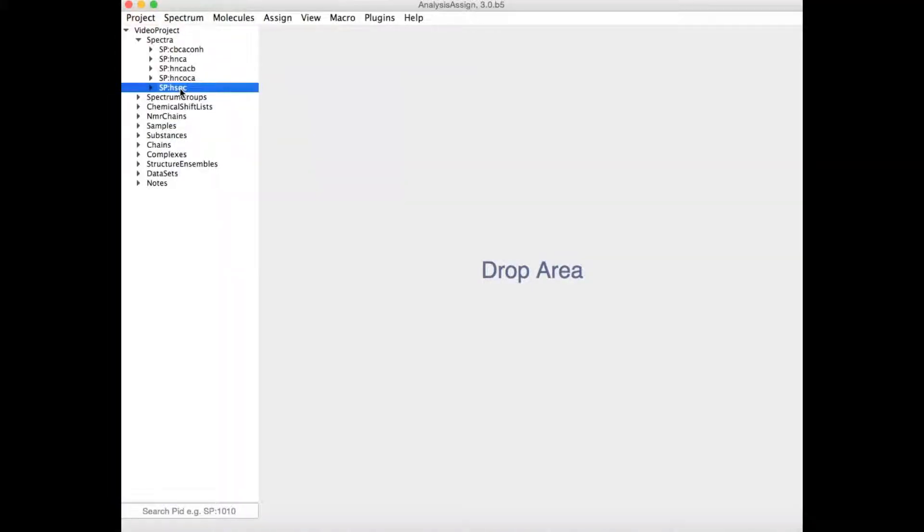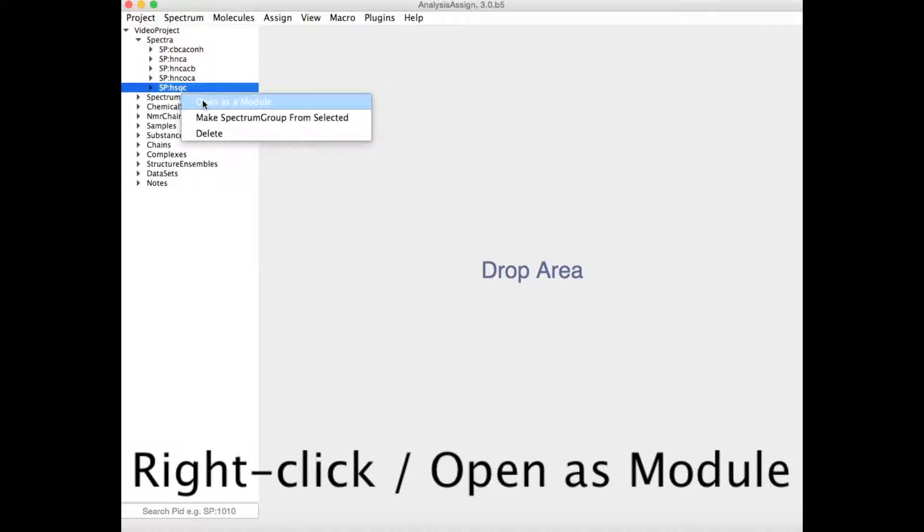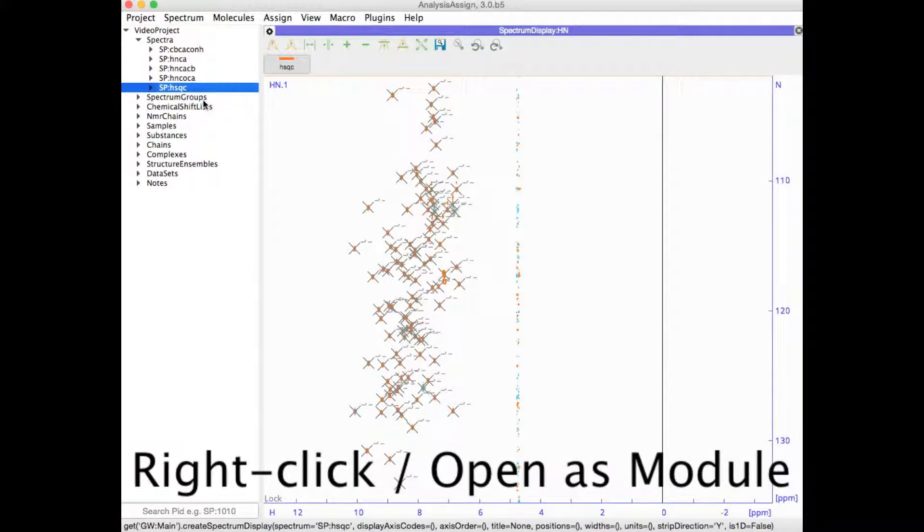The individual windows which go into the drop area are referred to as modules. You can open a module simply by right-clicking on a data item in the sidebar and then clicking 'Open as module'.